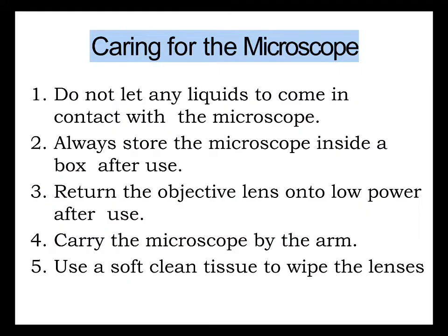Now, before I end my discussion, caring for the microscope. This is a very important part of carrying a microscope. Number one, do not let any liquid come in contact with the microscope. Number two, always store the microscope inside the box after use. Number three, return the objective lenses to the low power after use. Four, carry the microscope by the arm. And last, number five, use a clean cloth or tissue to wipe the lenses.